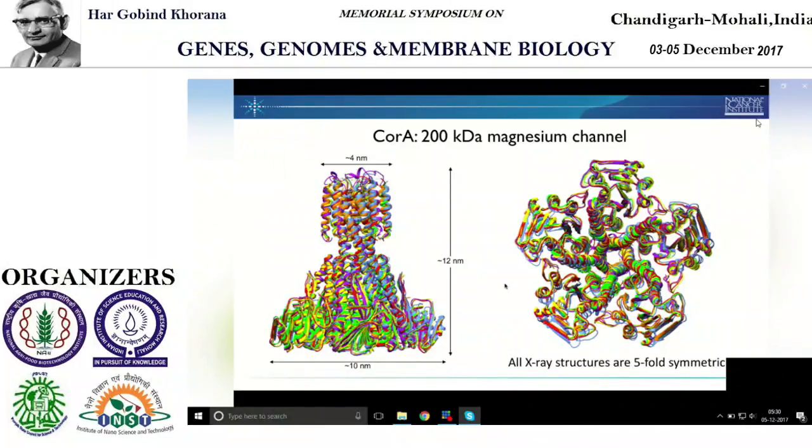So the structures that you see superposed are with and without magnesium. And the surprise here to biochemists and electrophysiologists is that the changes that people observed with spin labeling studies and with other readouts implied that the magnesium binding or loss of magnesium seemed to change the protein structure a lot, but this didn't show up in the crystallographic analyses.